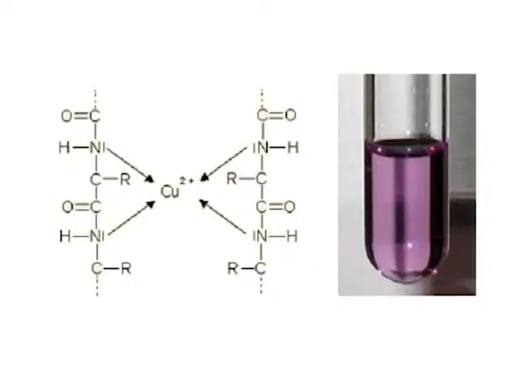Now we will be studying about Ninhydrin as a fingerprint reagent. Ninhydrin was first used as a fingerprint reagent in the year 1954 when two Swedish scientists S. Odin and von B. Hofsten developed latent imprints on paper, cardboard and similar material with its aid. A year later, Odin patented the procedure.